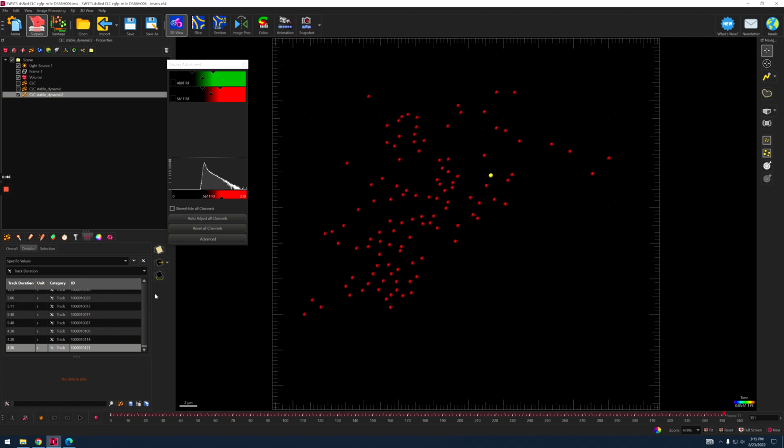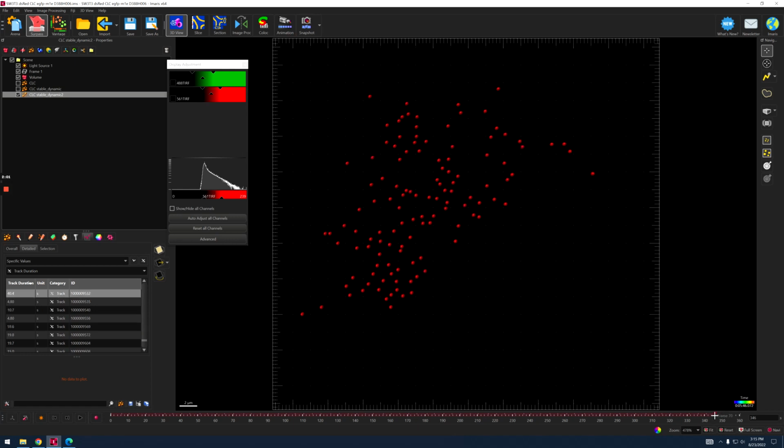So this is the track. And let's see if you have this 40-second track, where it is. It's here. You can scroll up and down with the arrow keys on the keyboard, and count whether it is legit to what the statistics says.